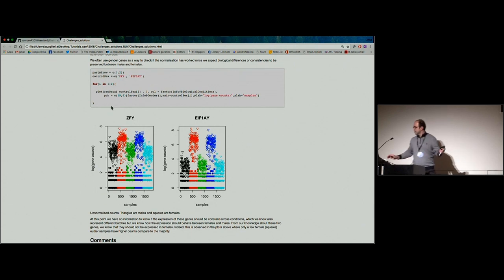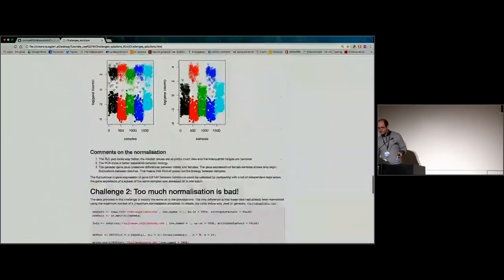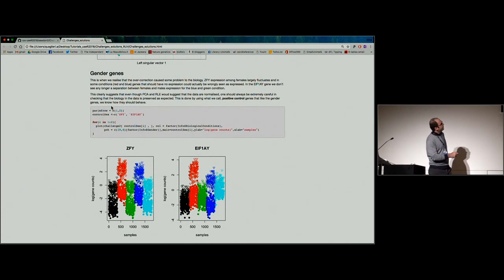I forgot to say, in an over-adjusted data set, which is here, except for this pattern, you can see that the genders are mixed up for this condition. You can't see the separation anymore for this treatment. You can see that all 3 are mixed up. Even for this condition and for this condition. You get the gender separated for these 2 conditions, but for these 3 conditions, we lose the gender separation because it's over-adjusted. Okay.